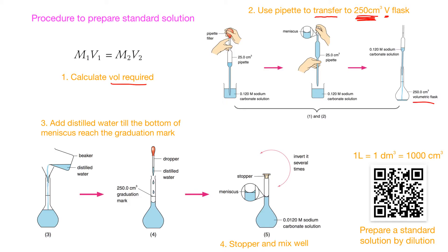After that it is easy - we just add distilled water till the bottom of the meniscus reaches the graduation mark. This is the graduation mark, and we have the bottom of the meniscus like this. Remember the curvature - the bottom of the meniscus touches the graduation mark, and that will mean the volume inside will be precisely 250 cm³.